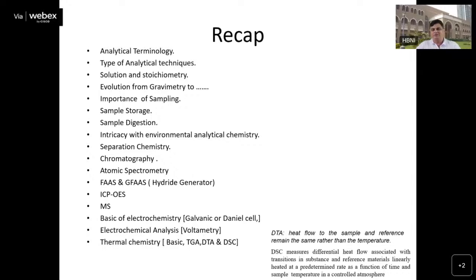We have seen, for example, if you have some lead content in a soil matrix, soil is basically an aluminum silicate matrix, and you have to bring the analyte out of it. Breaking that aluminum silicate matrix is only possible with a very strong acid treatment and the help of HF. Hydrofluoric acid has to be used to destroy the silica or to break the silica matrix.